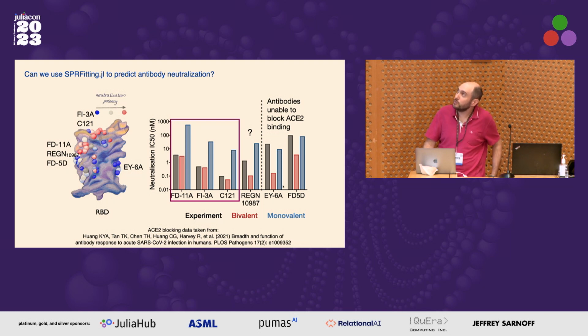And then there's 2 where these antibodies actually can't block ACE2 binding, and there's a bit of a structural story, so they're not great at neutralizing, and we don't do good at predicting ones that don't neutralize well, it seems, or at least these ones. So there's kind of a structural story, but among certain classes where they seem to interact near the tip of the receptor binding domain, we actually do very good at predicting neutralization.